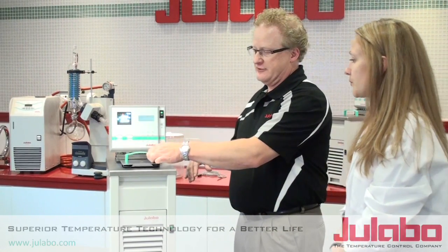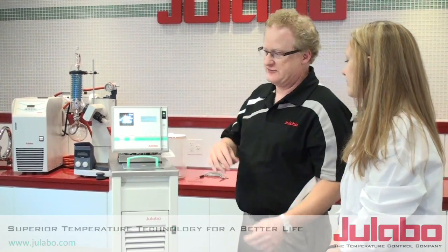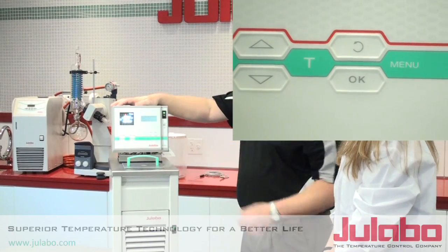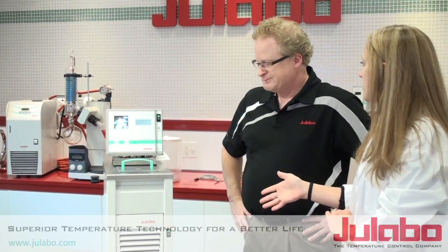That alarm is just telling you there's not enough fluid inside for it to operate properly. You can shut the alarm off by hitting the okay button.